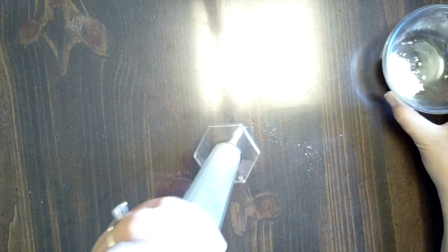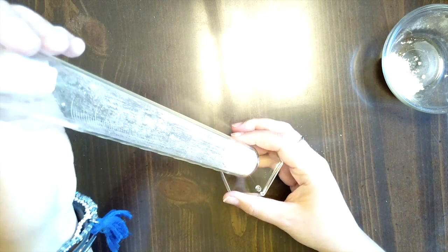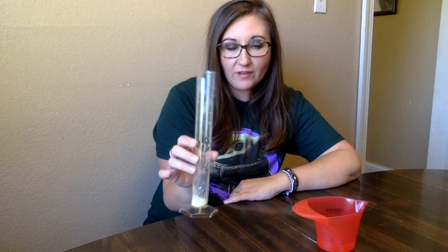You can a little bit. And so there we go. Now I've got my chalk in my graduated cylinder, or for you if you want to try this at home, into a water bottle. So now that I have my chalk in my graduated cylinder, I am going to pour some vinegar in here with it.